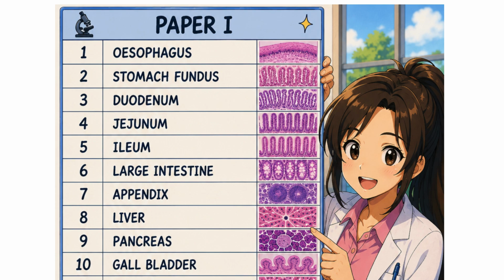Coming to pancreas, it is exocrine acini forming most of the tissue, and islets of Langerhans, pale staining round cluster cells scattered among the acini. You don't have any striated ducts, which distinguishes it from the parotid, that is your salivary gland.